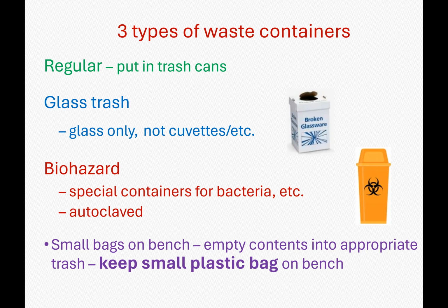Note that on your bench, there is a small orange container that has a bag in it. You can use this for your waste, things like your tips, etc., as you use them. At the end of the day, you'll take that to the appropriate trash can and dump the contents, but don't throw away the plastic bag. When we start working with bacteria, we'll throw the contents into the biohazard trash. When we're all done with that, we'll autoclave even the bag that's in there, put out fresh bags, and we'll go back to using regular trash.